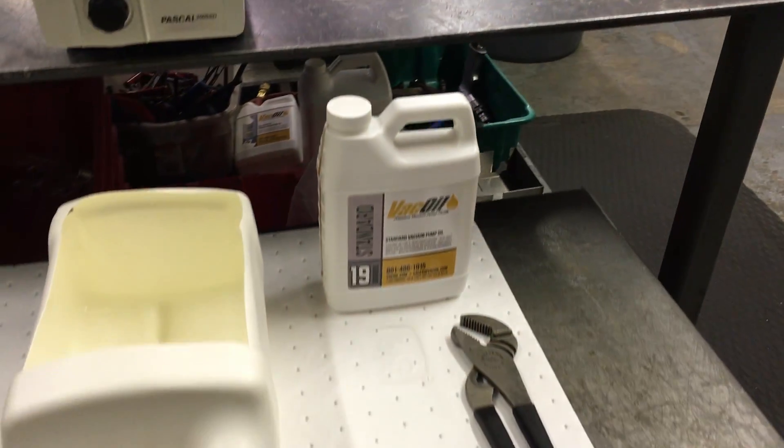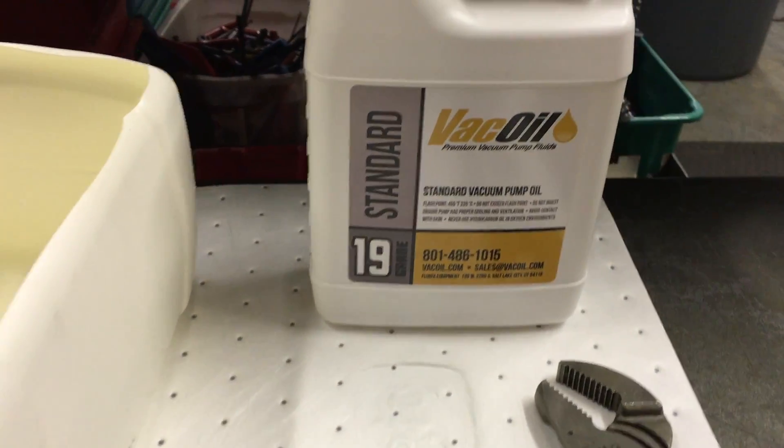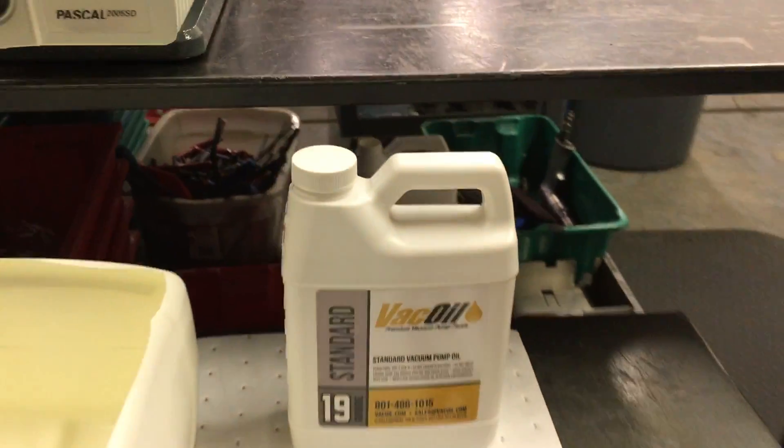Hi and welcome back to Fluidex. Today we are going to show you how to do a basic oil change on a two-stage rotary vane vacuum pump.